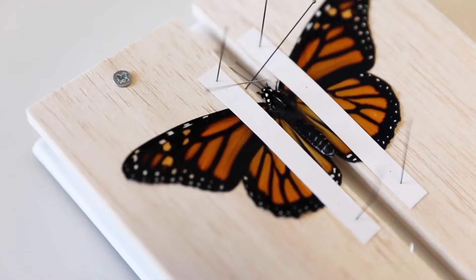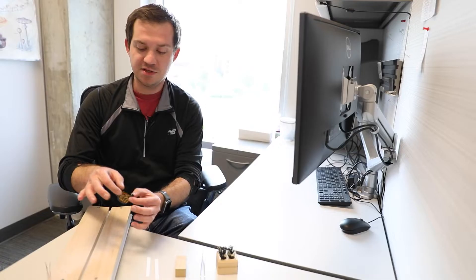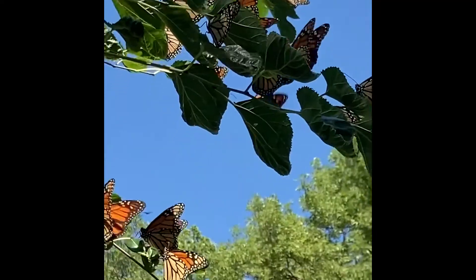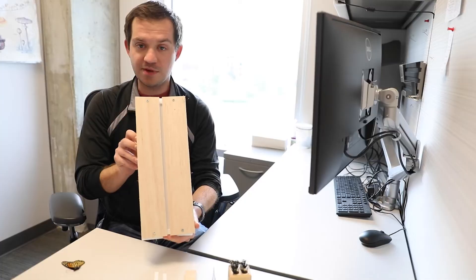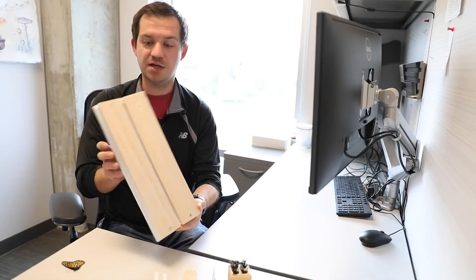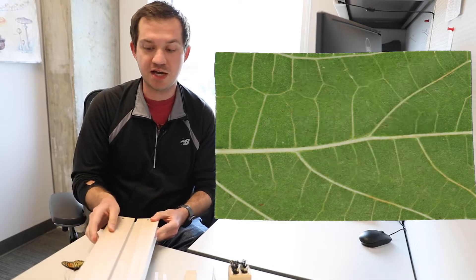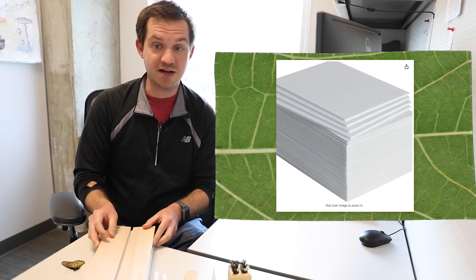We have a nice fresh monarch specimen that unfortunately was not able to make its migration down to Mexico this year, and we're just going to spread this on a pretty standard spreading board. There are many different types of spreading boards available - you can make makeshift ones out of insulation foam sheets that you can buy at a hardware store.